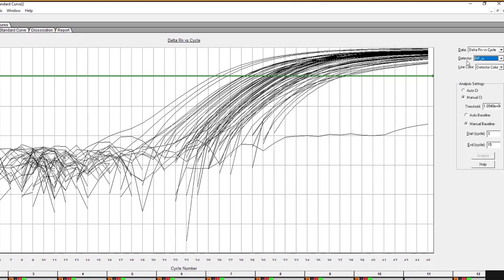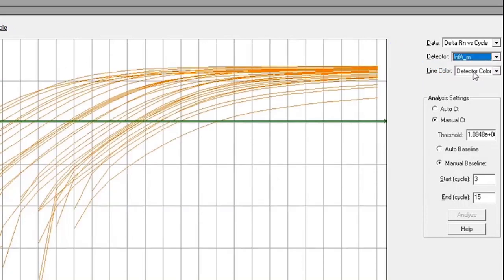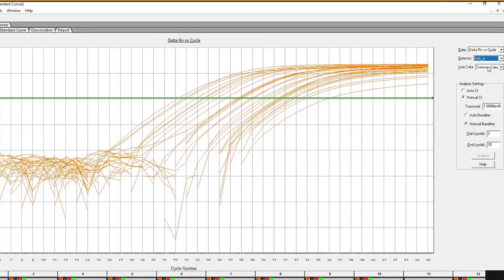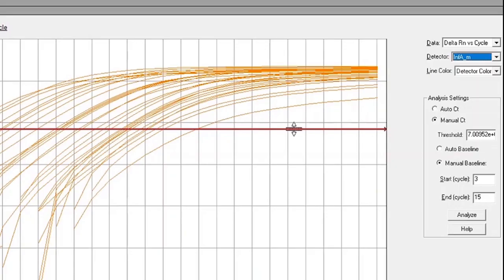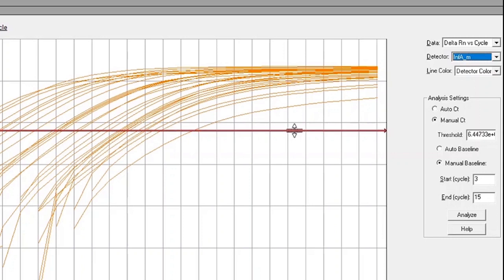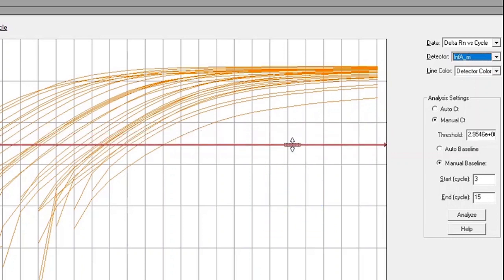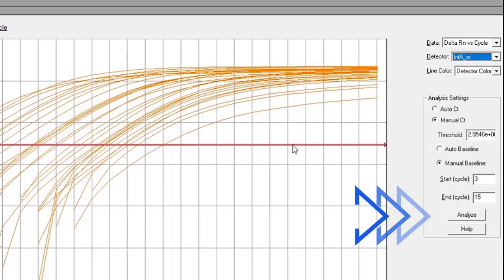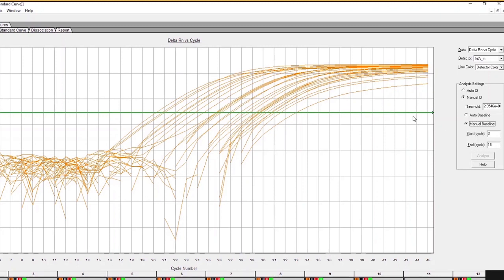To set thresholds by assay, select the first assay, Influenza A, from the Detector drop-down menu on the right. The amplification plot will only show the amplification curves for the Influenza A detector. Click and drag the red threshold line until it lies within the exponential phase of the fluorescence curves and above any background signal. Click the Analyze button in the lower right-hand corner of the window, and the red threshold line will turn green, indicating the data has been analyzed.